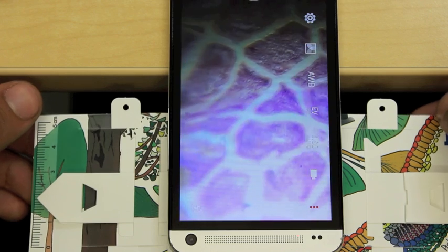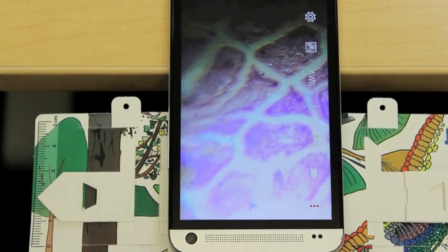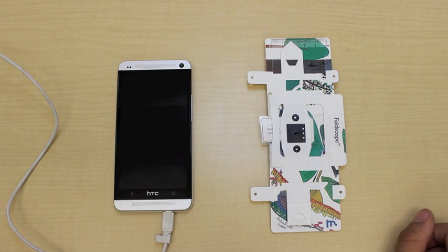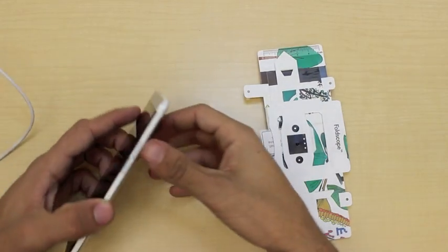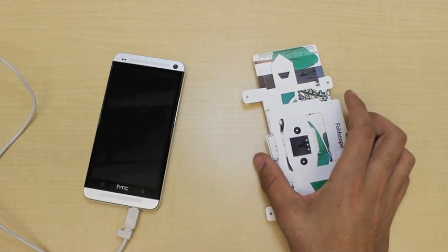So there you go — that's me using the foldscope with my phone. The magnetic strips also serve another purpose, which is to allow for projection microscopy. This means you can use the flashlight on your phone to actually project the image that you're seeing so that other people can see it as well.